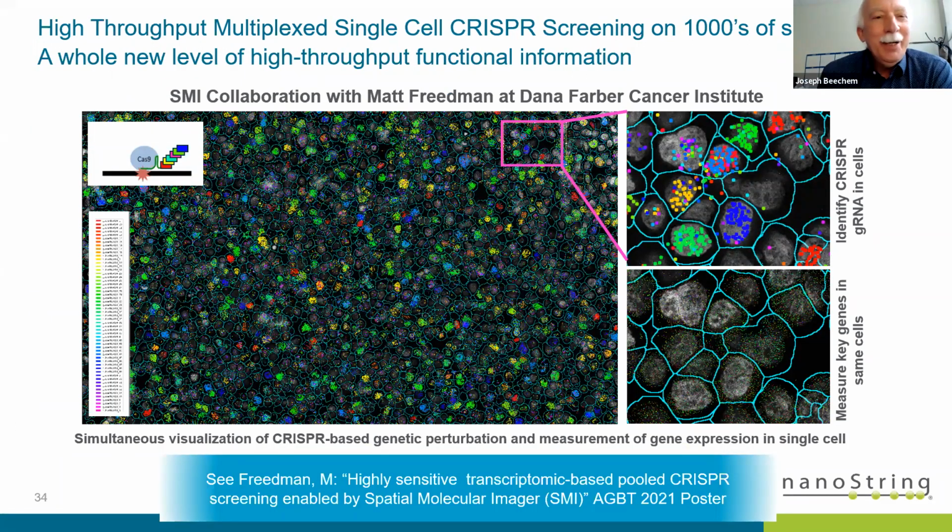Okay, I want to give you another flavor of a particular application of this, and I'm excited about this one also. We're talking about CRISPR-Cas9 screening. So instead of just being passive with your tissue or your cells, monitoring what they're doing, let's go proactive. Let's start engineering with CRISPR-Cas9. And then can we get functional readouts of cells at the same time we're engineering them?